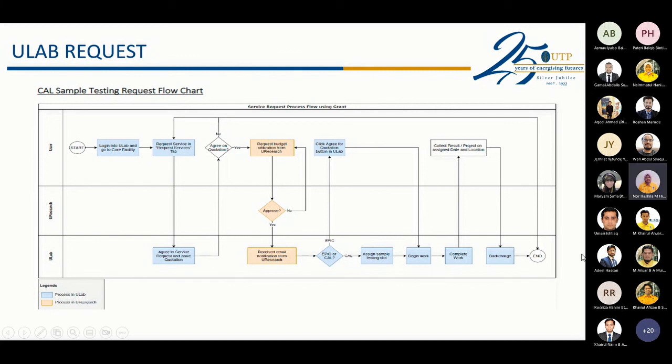Okay, and then the question from Ali Raza: if there is a mineral that is not already defined in the software, can we still use it to know the crystal structure?